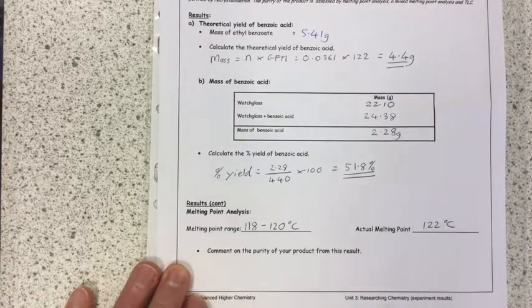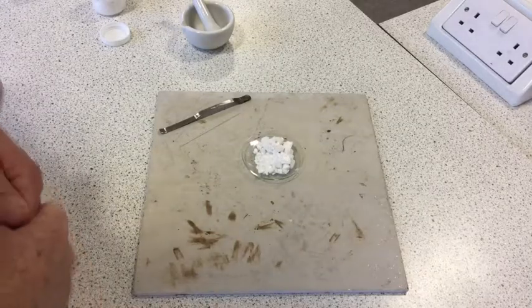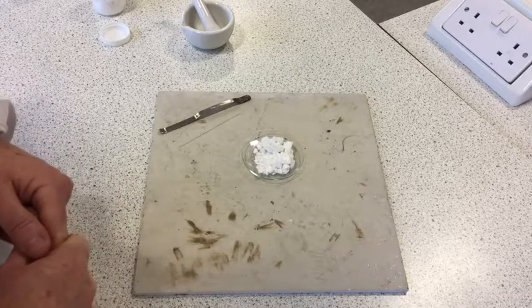The melting point range of 118 to 120 degrees C, with the actual literature melting point being 122 degrees C — I'm reasonably happy with that result. It suggests that there are some small impurities in the sample, but it's pretty pure. The results from our melting point analysis suggest that we've got a pretty pure sample of benzoic acid, but it's recommended to double check this by doing a mixed melting point analysis.